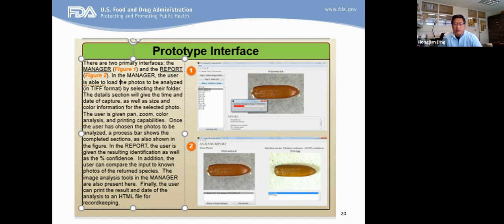It will say, let's say, 99% confidence that this is species A or species B, and we have a threshold. If it is lower than 90, we don't trust it, it's just a reference, and we go through and identify them ourselves. That system is an open system, so if we confirm that identification, we enter it into the system. The system will remember that, okay, this one is species A, and that's the AI technology involved.